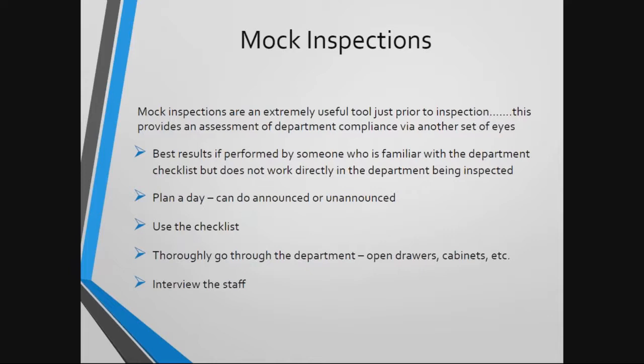Upon completion of the mock inspection, I will prepare a report for the supervisor, generally outlining what I would have cited as a deficiency if I was performing a real inspection. And then as follow-up, I will request from the supervisor a response and then corrective action, but obviously the corrective action is something that they will put in place prior to our on-site inspection actually occurring.